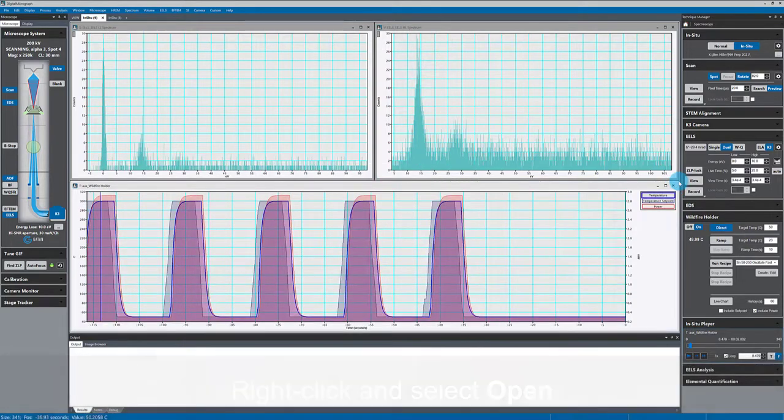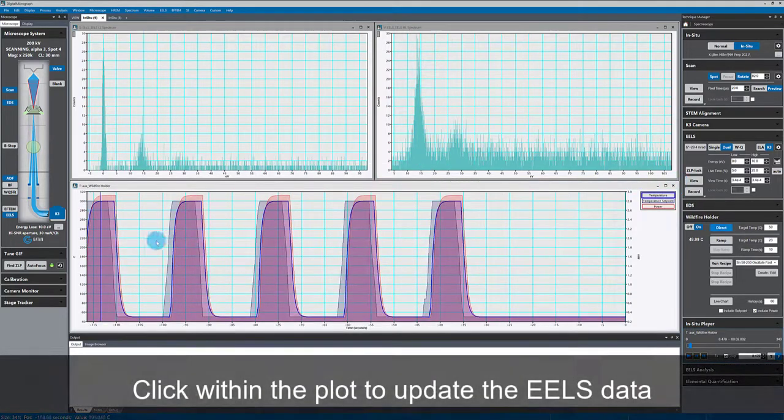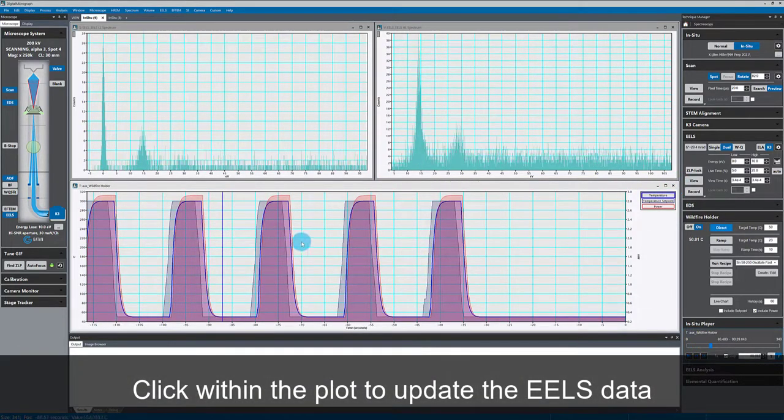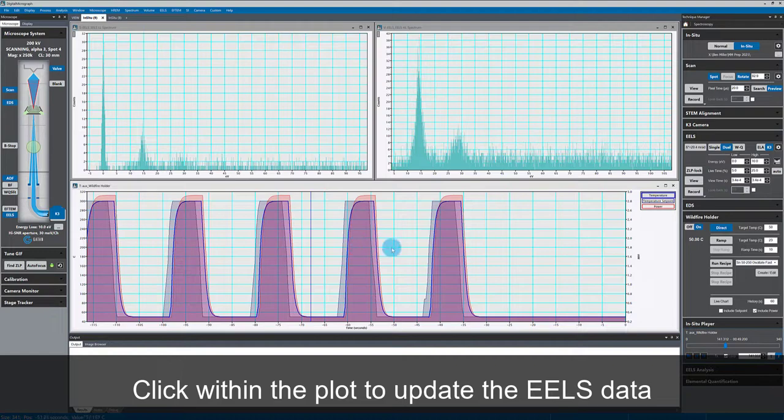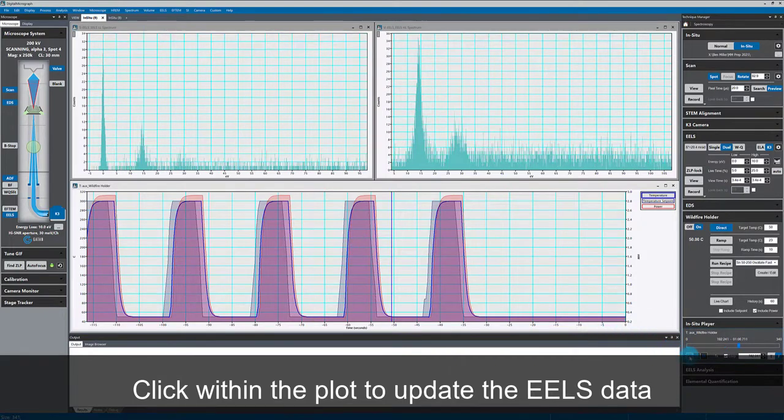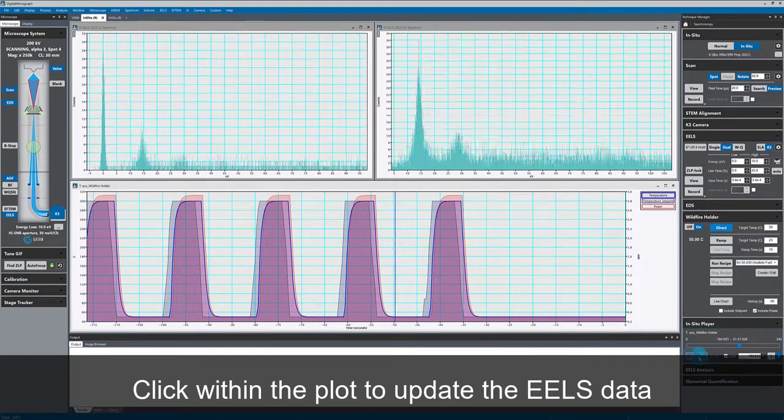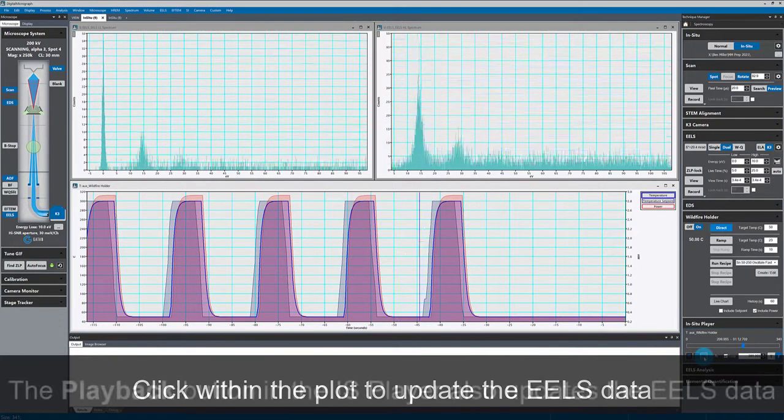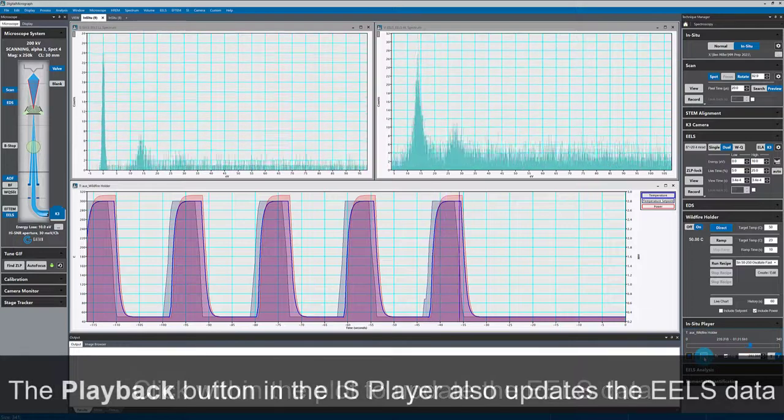If I click within this temperature plot, this updates my EELS data. And if I playback the data with the IS player, that also updates the EELS data.